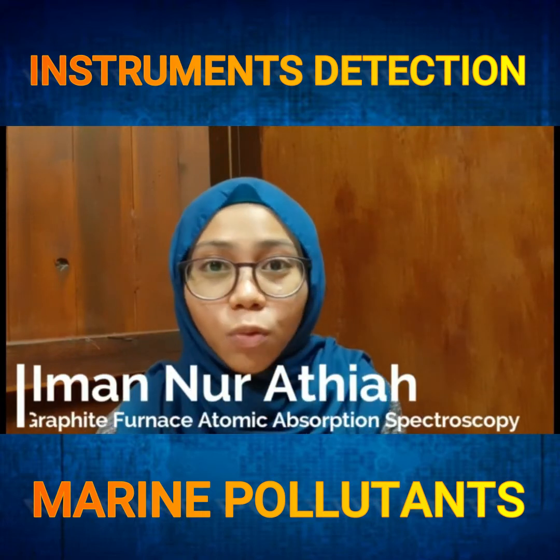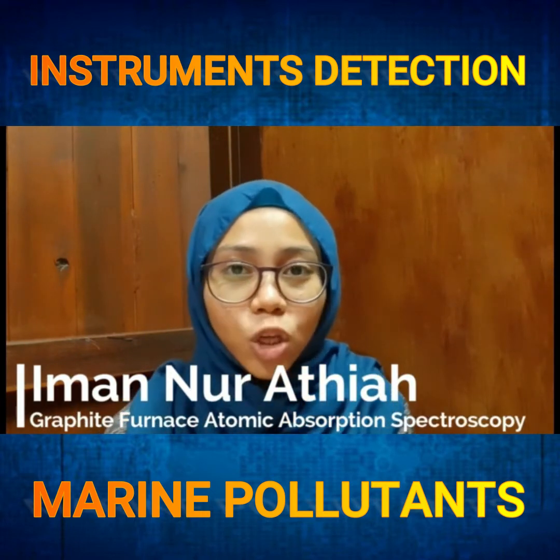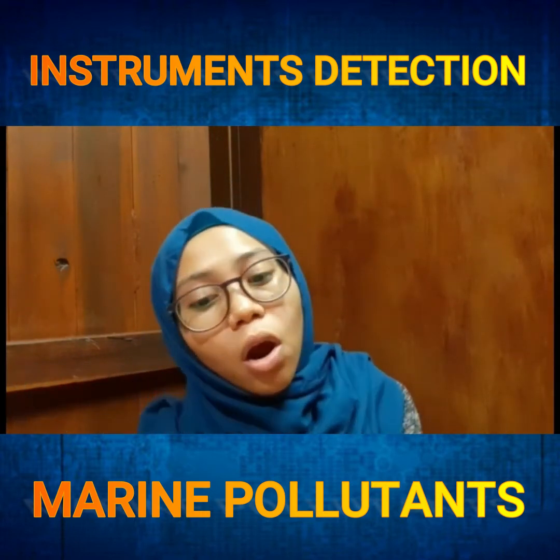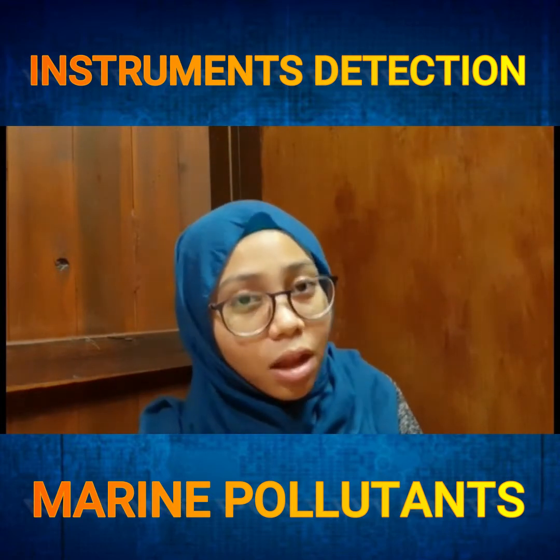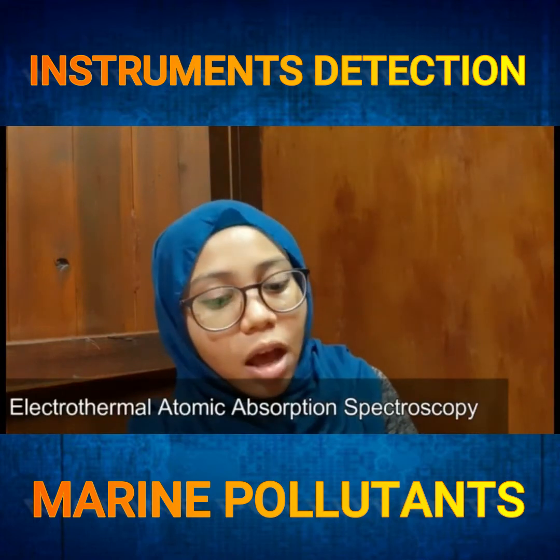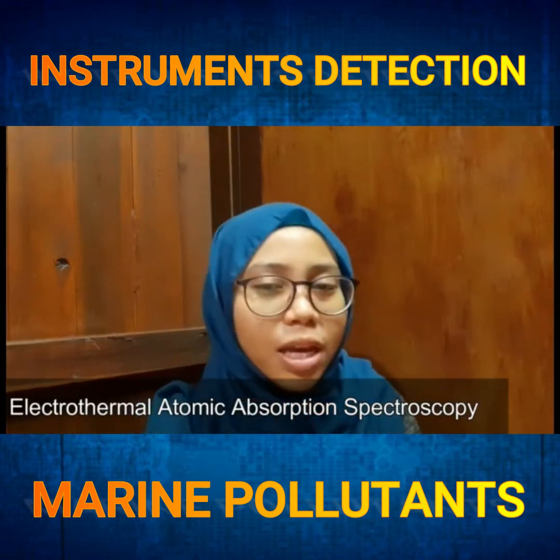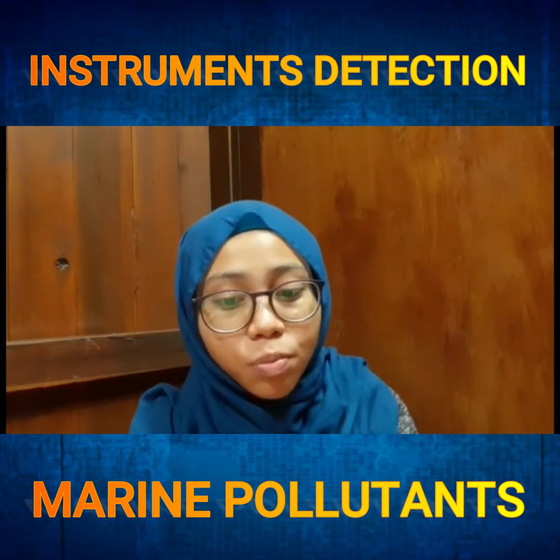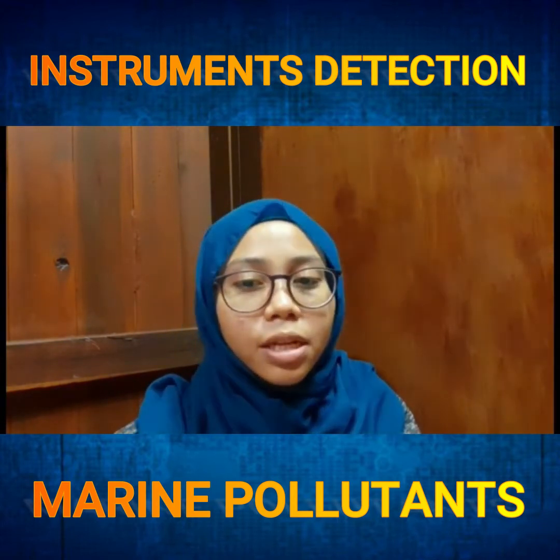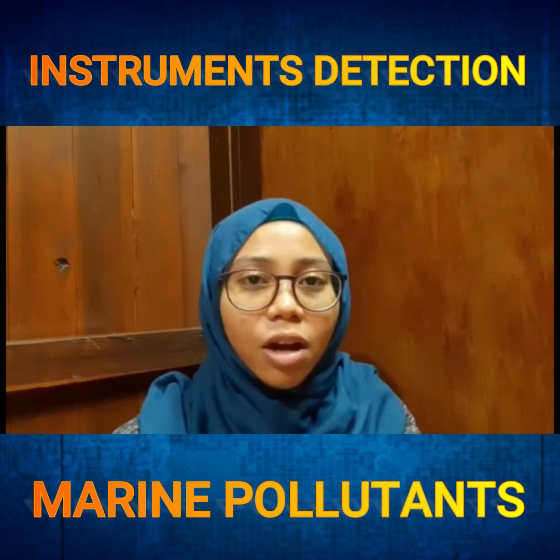My name is Iman and I will talk about the graphite furnace atomic absorption spectroscopy, or known as the GFAAS. This instrument also has another name, which is the electrothermal atomic absorption spectroscopy, ETAAS. This is a type of spectrometry that is a known method involving electrically heated graphite tubes.